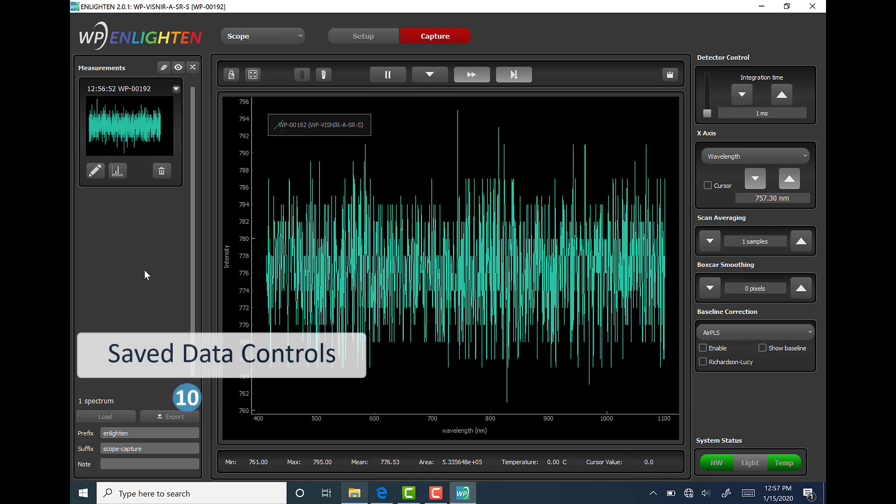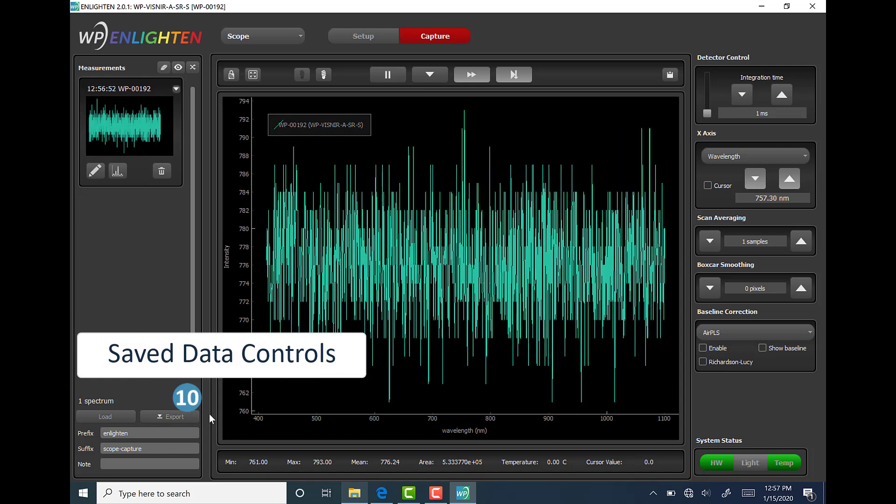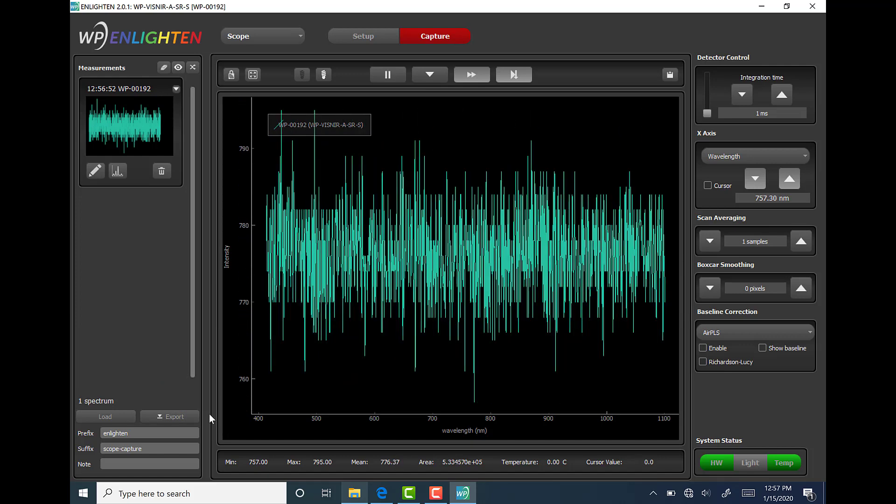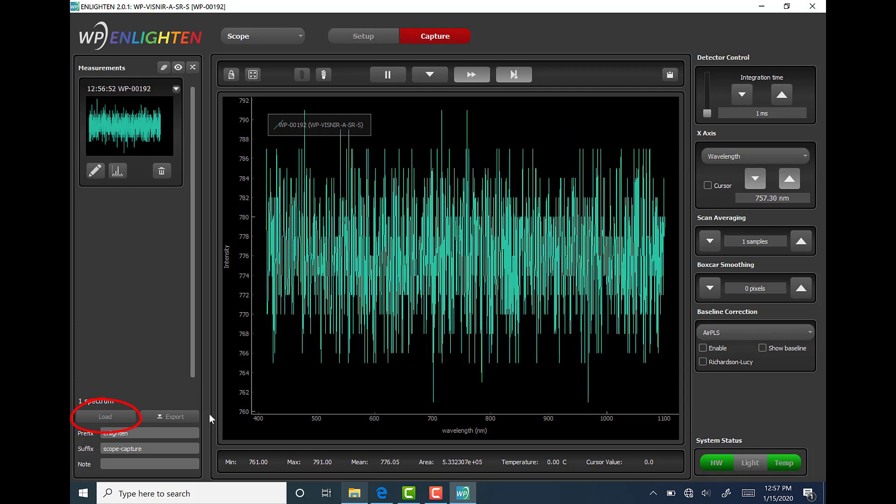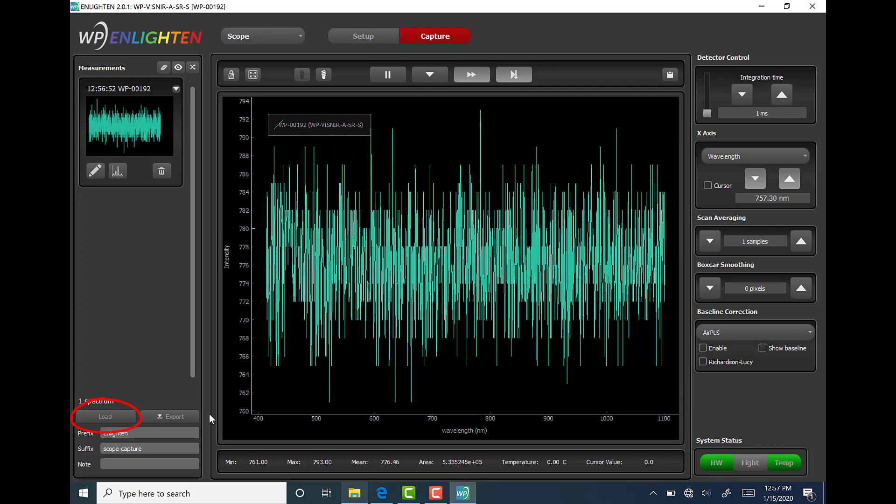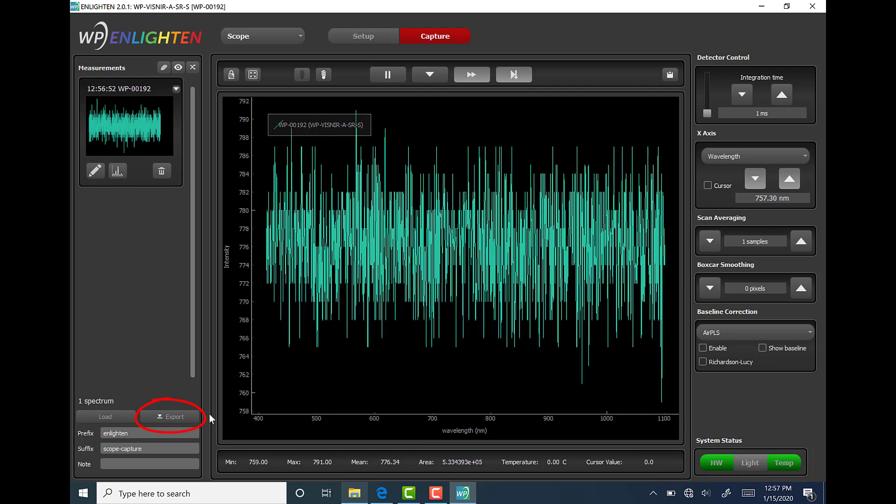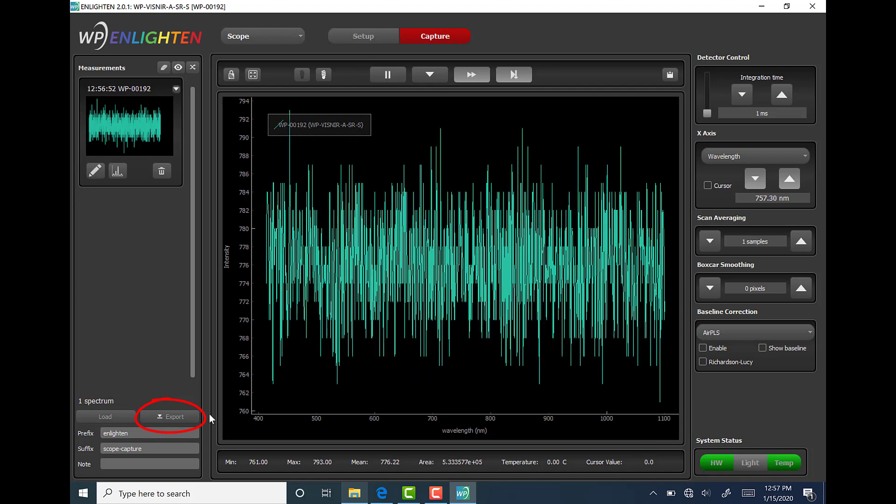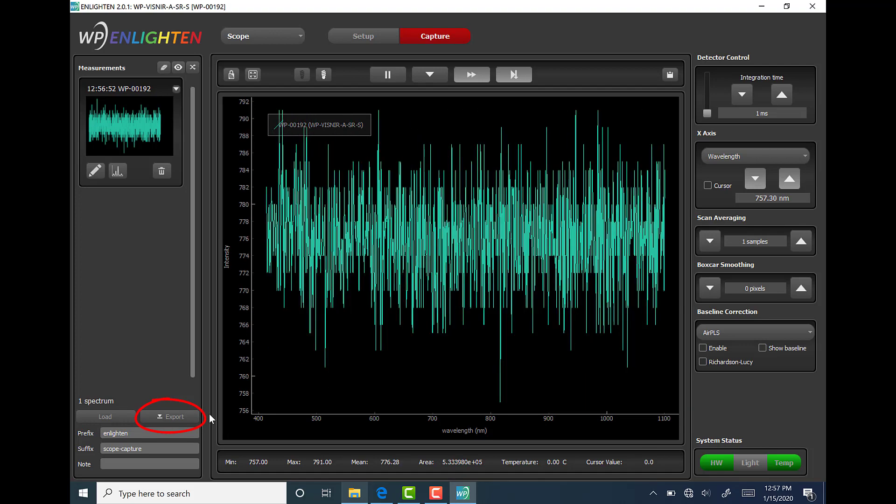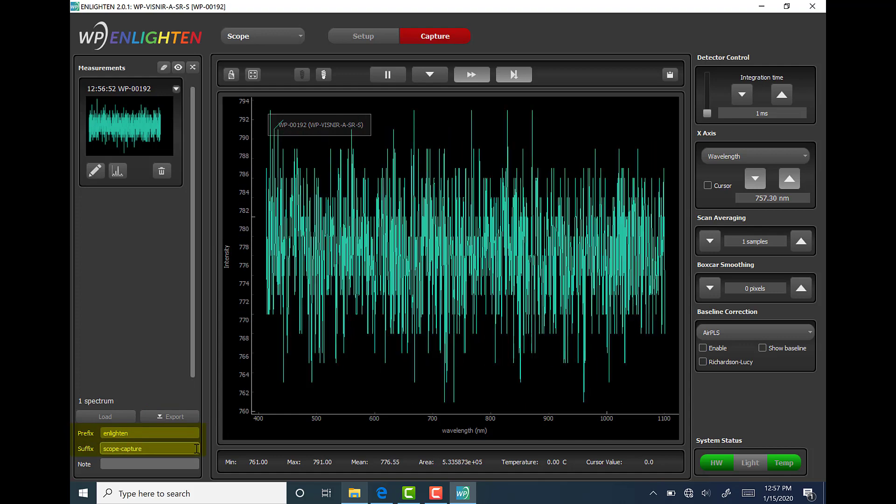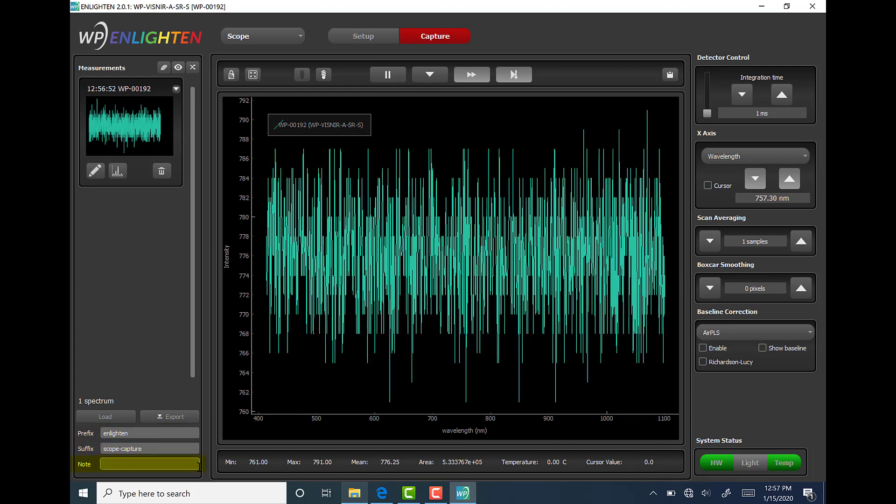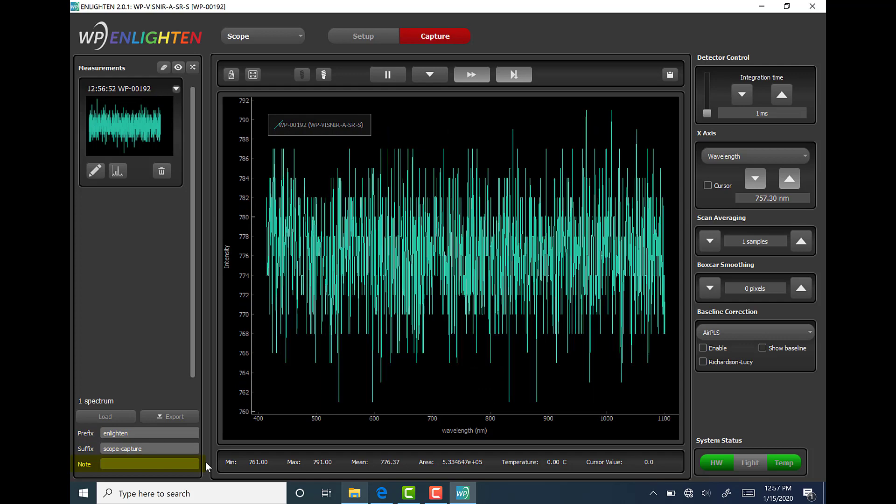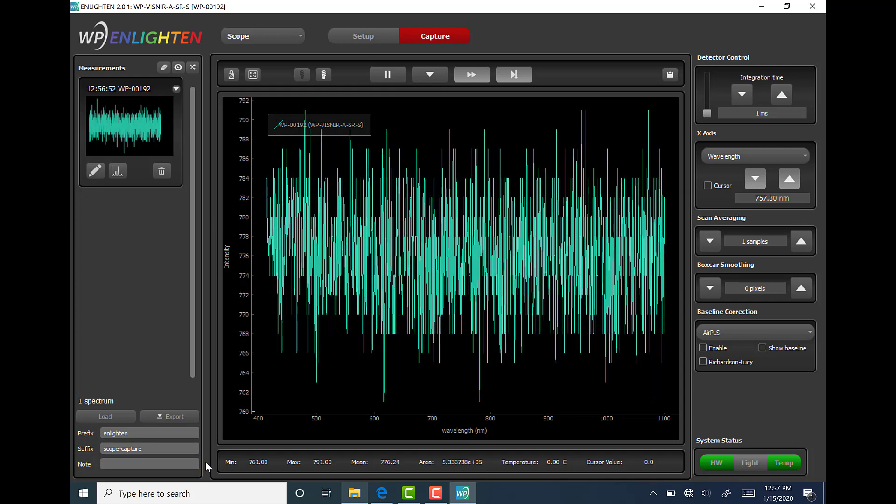The saved data controls can be found beneath the measurements column and this area allows the user to load previously saved or acquired measurements from your disk or hard drive. You can also export a series of saved collections as a single file which can come in handy for offline analysis. A prefix and or suffix can be added to the file name as well. Furthermore, notes can be embedded into the file itself if desired.